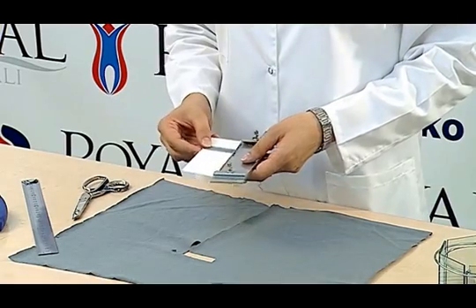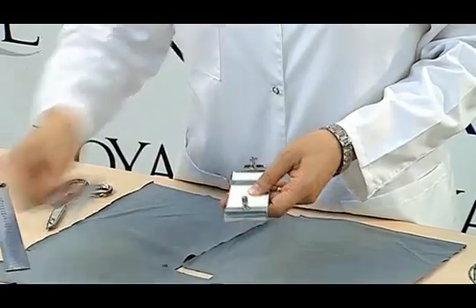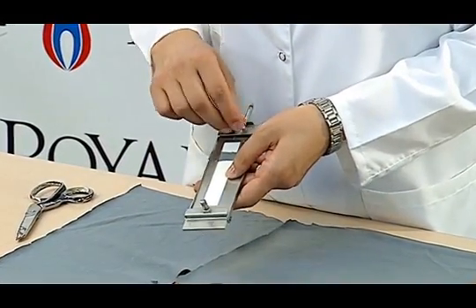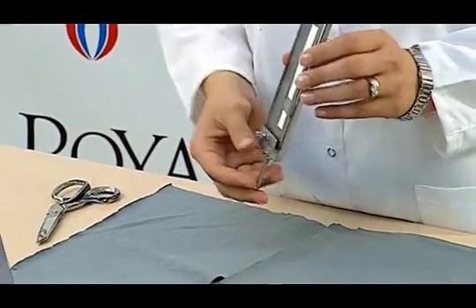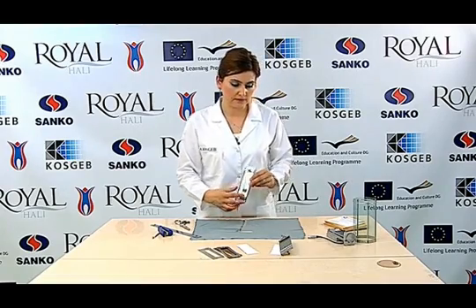Placing the prepared sample into the holder apparatus, we cover a specific part of it with a mask. As you can see here, the place exposed to light remains uncovered.